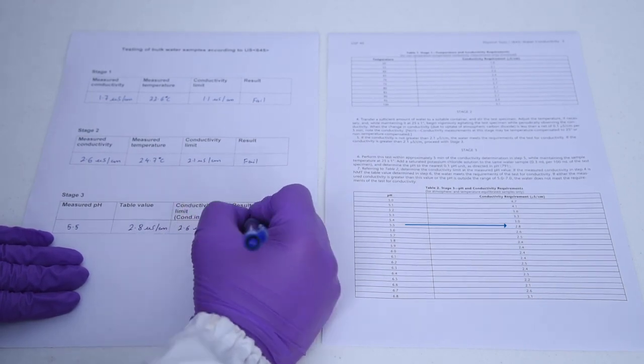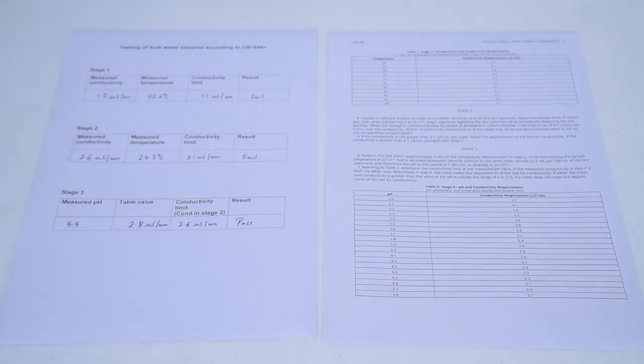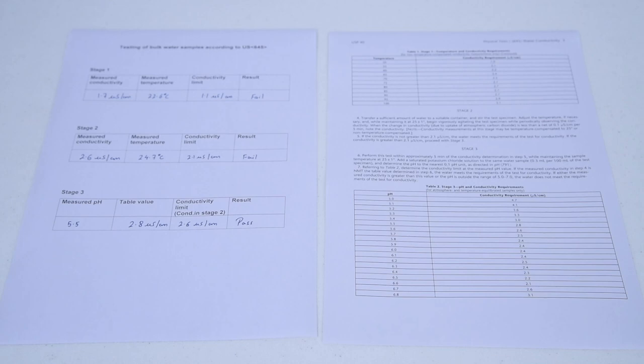In our case, the pH value corresponding to conductivity value measured in stage two is between pH 5 and 7.00. So the water meets the requirements of USP 645.